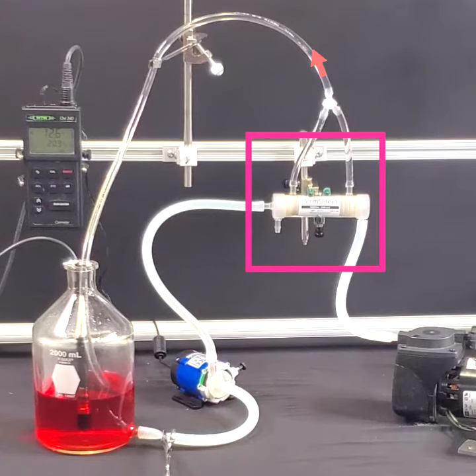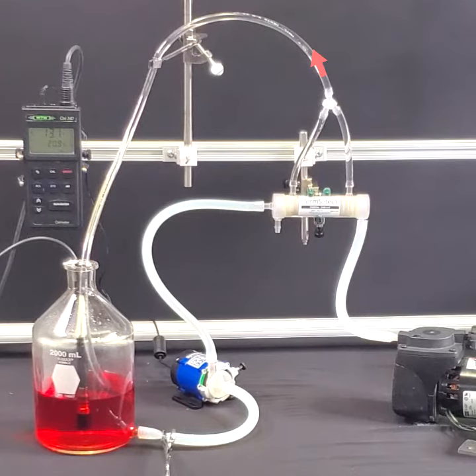We are using a PermSelect PDMS-XA-2500 gas exchanger with one quarter square meter membrane area to oxygenate the water. The oxygenated water is then returned to the bottle. Air flows in one port of the lumen side of the gas exchanger and vents out the other port.